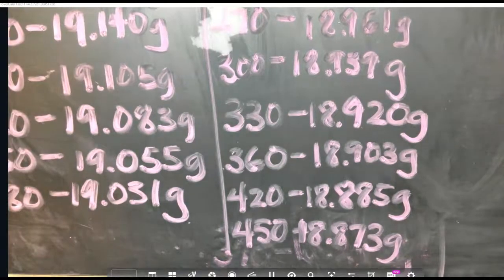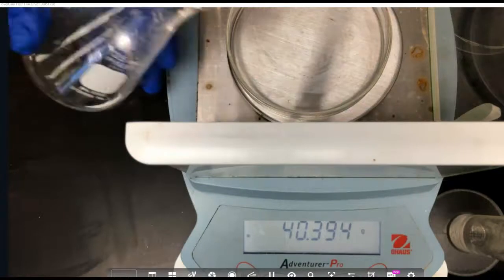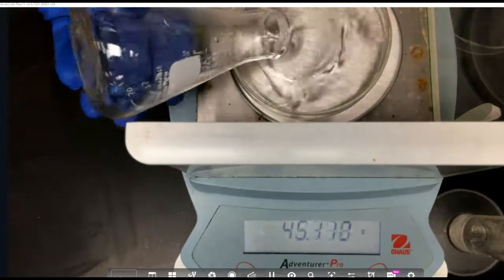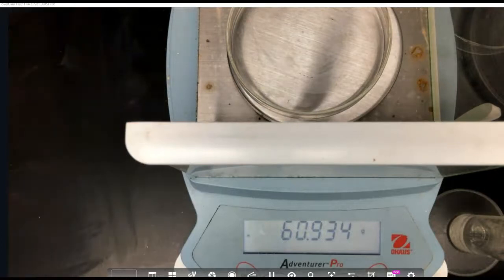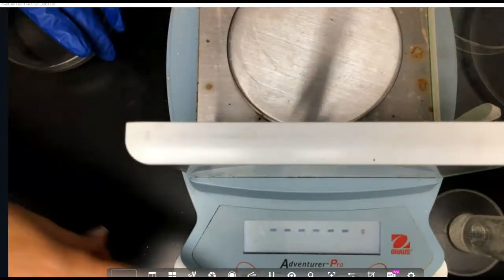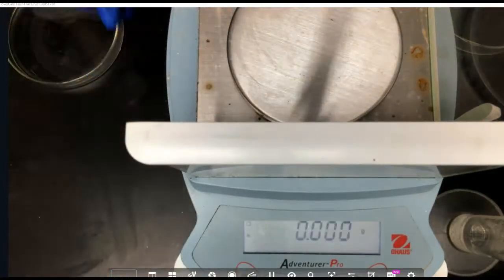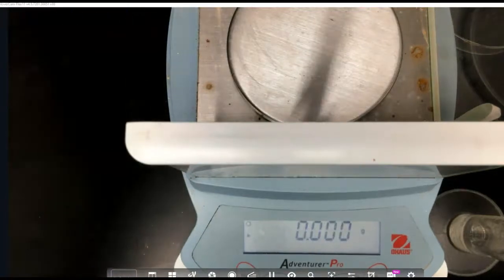Okay, so our next one, as you can imagine, is now going to be where we change the temperature. For this one we are using 1 molar hydrochloric acid, but it has had its temperature increased by 10 degrees. And we need to remake this to 0. And I've got to pour that back in. You guys, the struggles are so real.